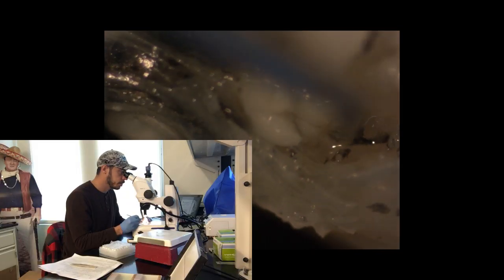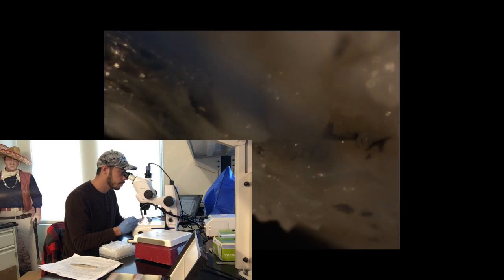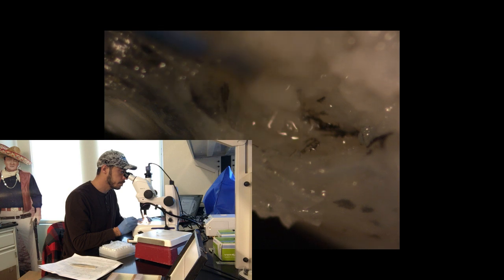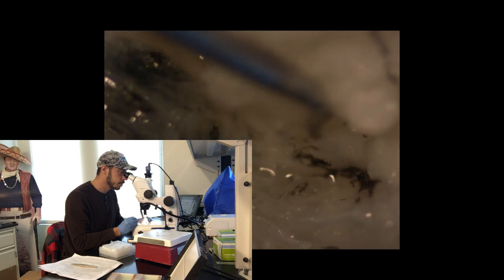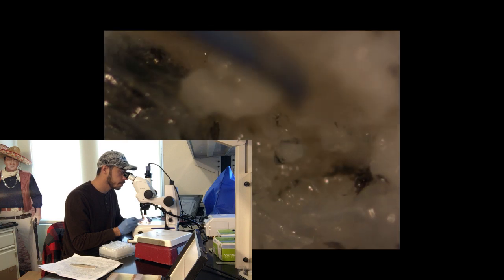So I changed the focus here because now I know where the otolith is. I can see right where the black pigment is where I've currently focused — that's actually where the otoliths are sitting at the moment. We're on the left side of the fish right now. I've had to switch over to another fish, hence the kind of abrupt change here. Right where the melanophores are, you can actually see the sac right now. I'll drop out this video on the bottom left-hand corner so you can see everything better — just wanted to give you a side view of the process from outside the microscope.